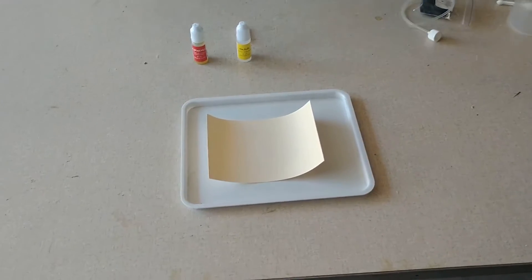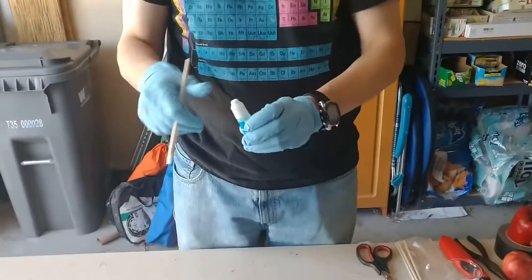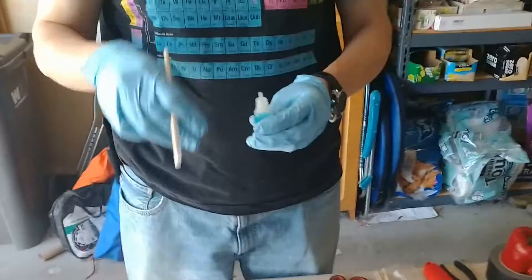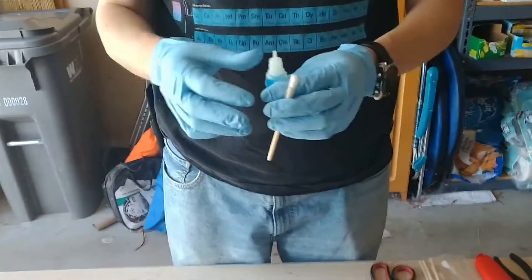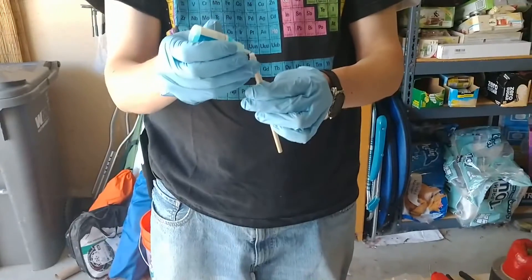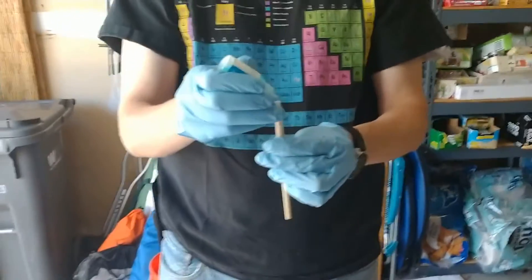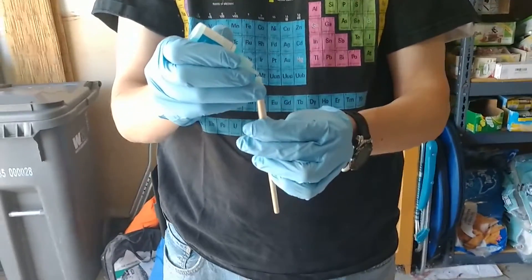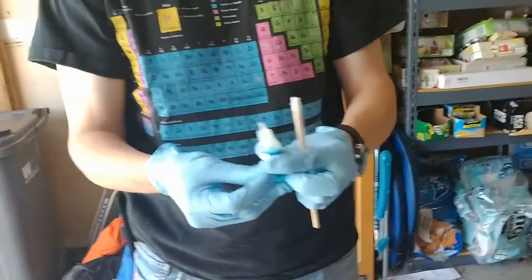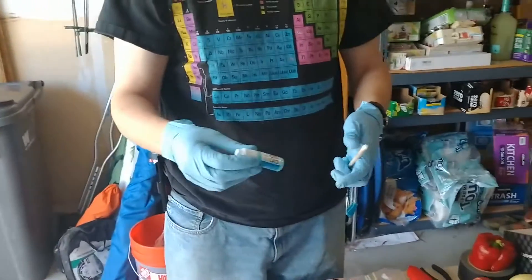I'm going to start with some copper sulfate. We're going to put about three to five drops of the copper sulfate on the tip of this cotton swab pen here. One, two, three. There we go. That should do it.